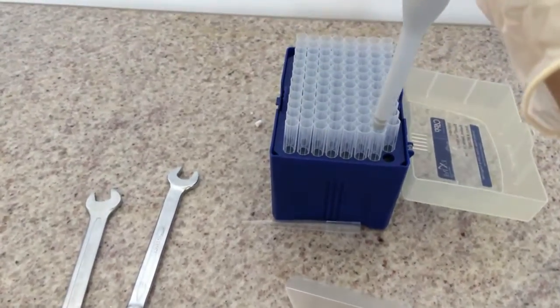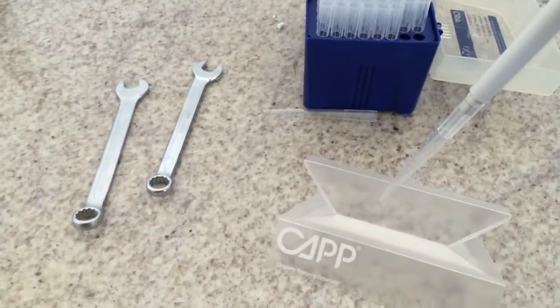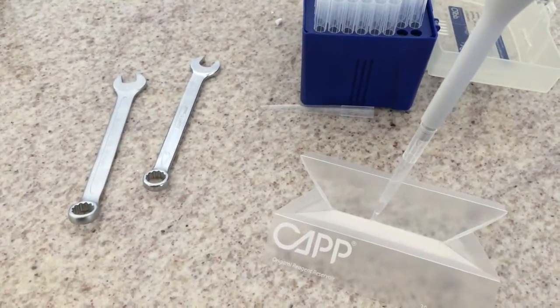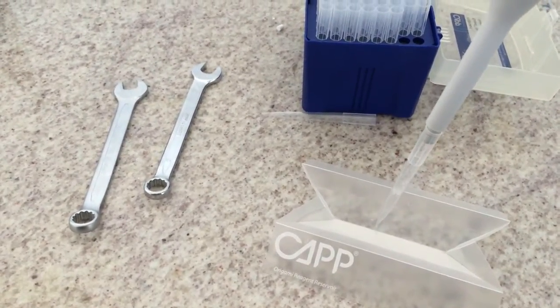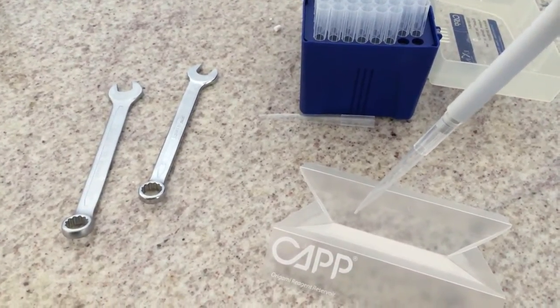Discard it, mount a new tip, pre-wet it once, and then you can start pipetting with good expectations of accuracy and precision.